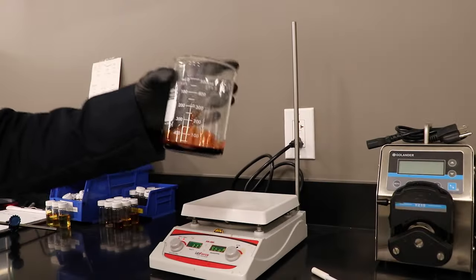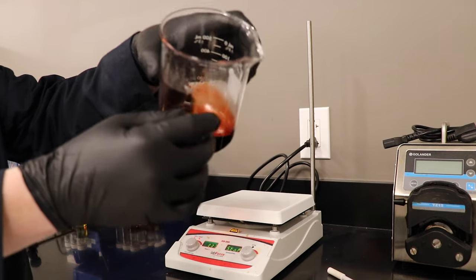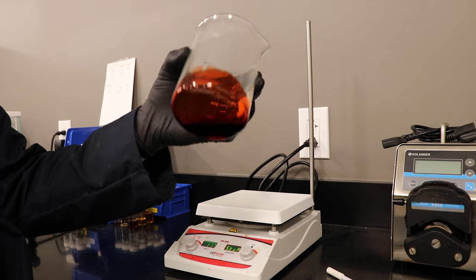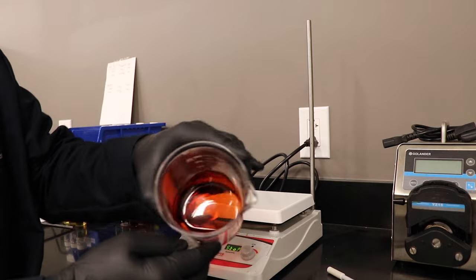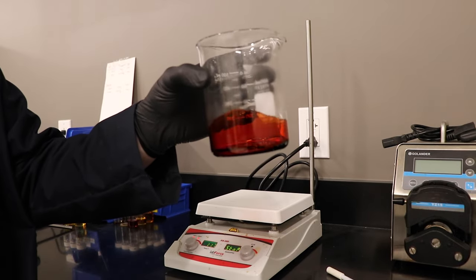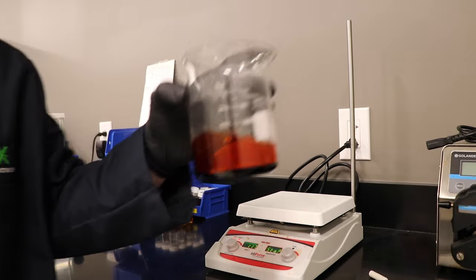Okay, so I let our reaction proceed for 1 hour, and as you can see, it is blood red, still nice and thick. And now I'm going to test it and see what our ratios are, our levels are.